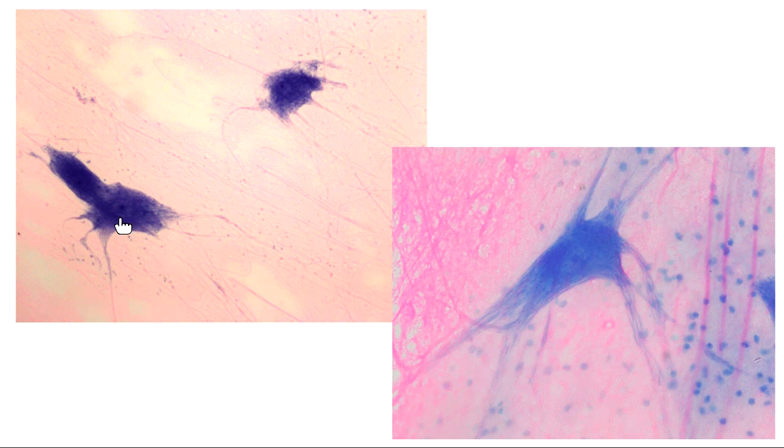So neurons, the dark blue funky shaped stuff, you can see their nucleolus in the very middle. And then especially on this picture, see all of these little blue dots here? All of those are the neuroglia. All of those are the helper cells that help this kind of tissue to function.